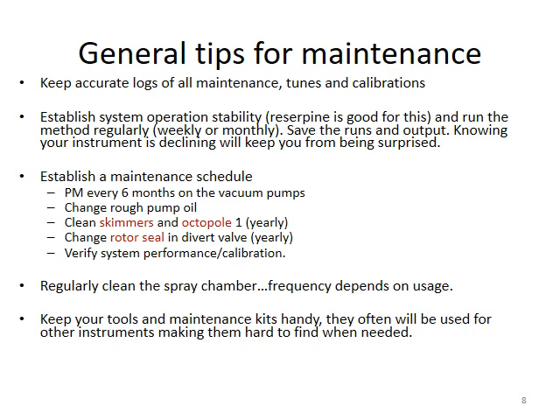But of course, there is a need to keep a log for your own routine maintenance, such as when you have cleaned up the source chamber. This wouldn't be tracked, so you have to manually write it up somewhere. And when you have changed the reference solution, and also the tuning mixture, and so on.